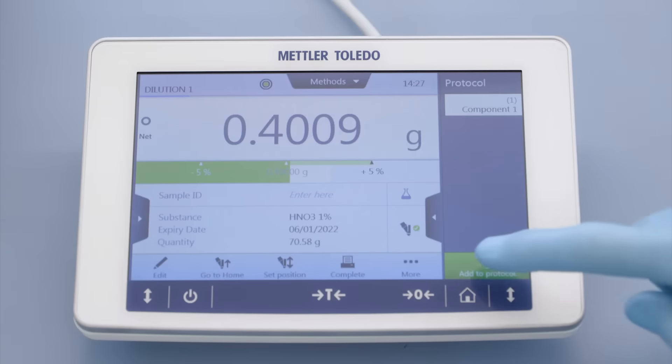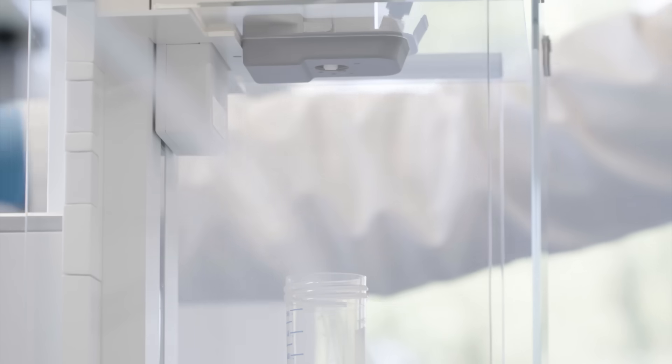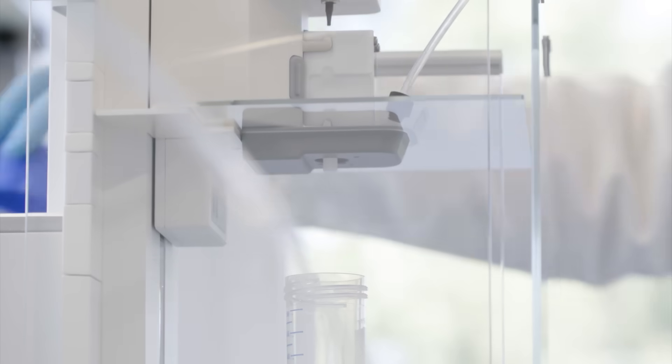The XPR automatic balance automatically calculates the precise amount of solvent needed to achieve the target concentration and dispenses the liquid directly into your container while you can use this time to perform other tasks.